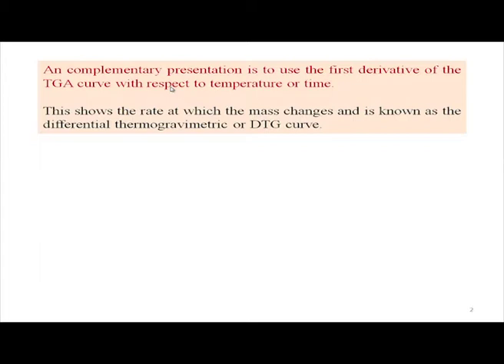So, the methodology for this analysis gives us something which we call a DTG curve, which is nothing but another form, a complementary presentation of the first derivative of the TGA curve with respect to temperature or time.